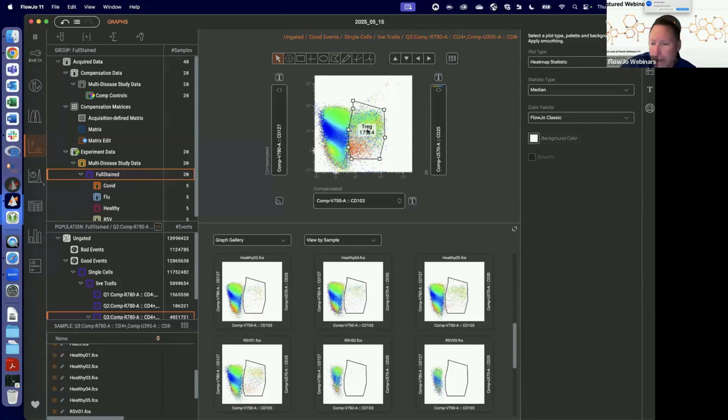Okay, there we go. And oh, question, and Serena got it. Thank you, Serena. Greatly appreciate it. All right, so there's our T-regs. Cool. Let's flip off virtually concatenated. And I think that is probably most of the things that I wanted to show for now in the graph gallery. Let's move on to some platforms.